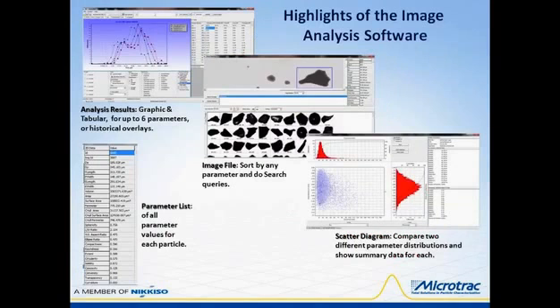Here are 4 screenshots displaying some important features of the image analysis software, whether in a lab or an online instrument. Starting in the upper left is the analysis results display. Up to 6 different parameter distributions can be reported here, or overlays of 6 different analyses for one parameter for comparison purposes.